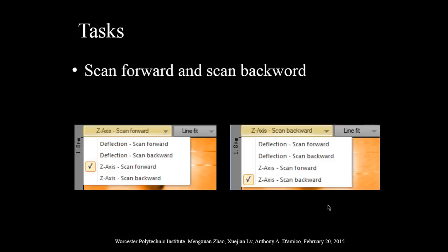After you have got the image of the bit, select the axis scan forward for the left side of the image and cross-section, and the axis scan backward for the right side of the image and cross-section. You should see hysteresis between forward and reverse cross-section images. Try to explain it.